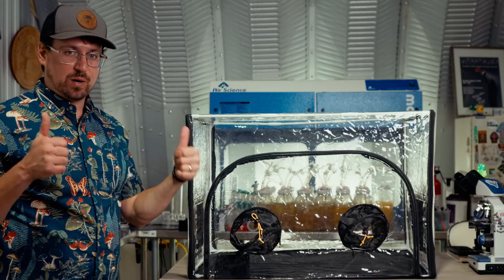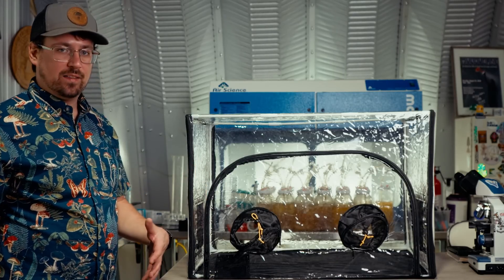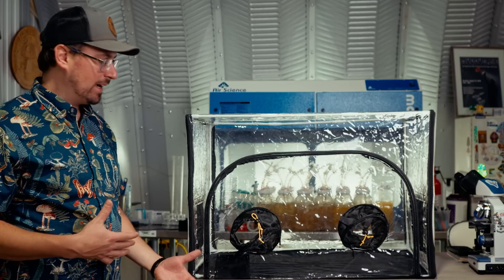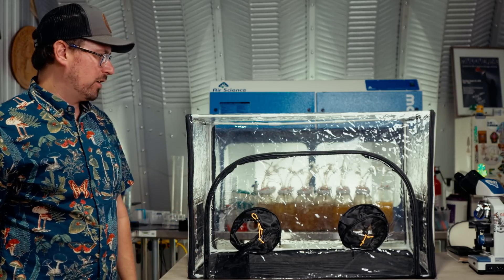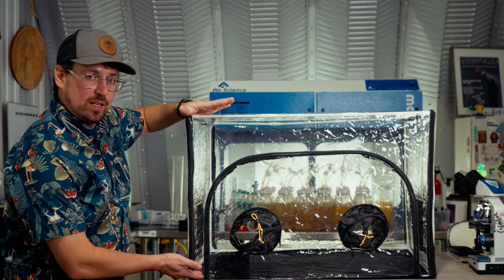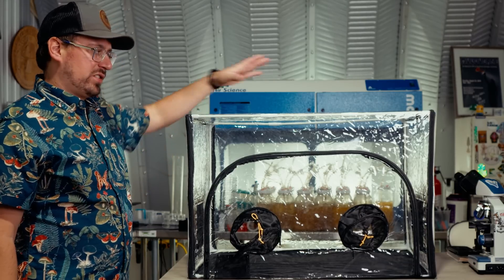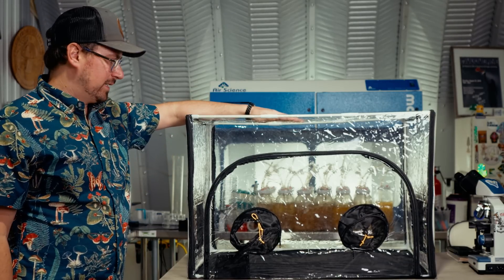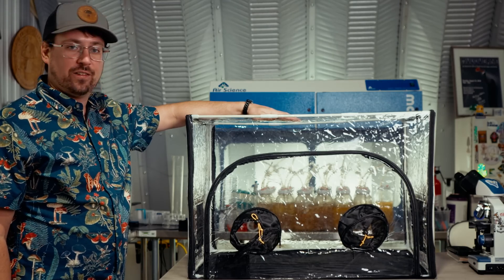I give this product two thumbs up. The next test would be if it fits a full monotub or whatever you're trying to work with — height-wise there might be a little constraint for working with grow bags. But overall, this is a really nice, high-quality still air box, and for the money it's definitely a winner.